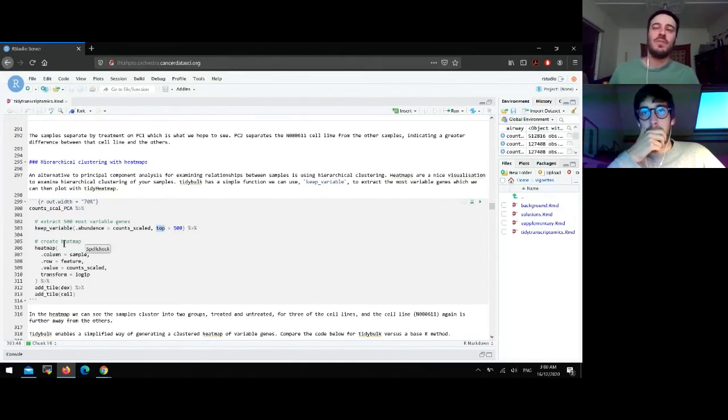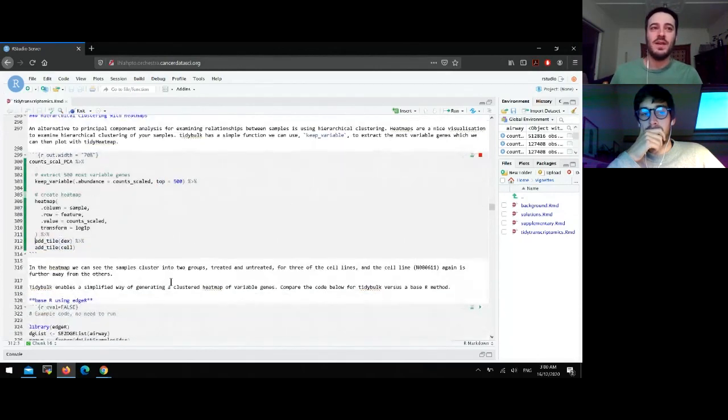And the heat map package we will use is called tidyHeatmap, it is on CRAN. And this will allow us to input any table and output an annotated heat map, to which we can add annotations simply, in a modular fashion, simply writing down the columns we are interested in.